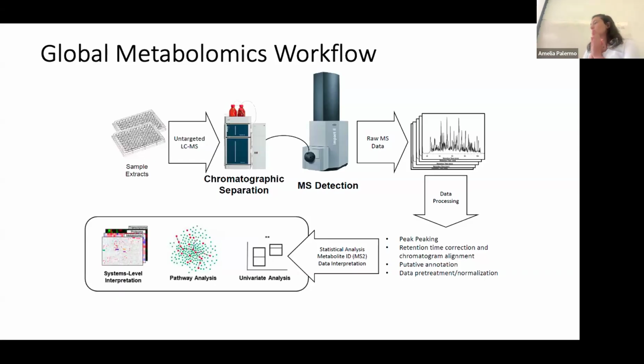By separating through liquid chromatography, we are able to simplify over time the composition of our sample, and that allows us to inject different metabolites gradually. Even if the mixture is not 1-to-1 at every time of the chromatography, it's still way more simple in composition than a shotgun injection, right? Injecting everything at the same time. So that's one of the first advantages: we drastically reduce ion suppression.